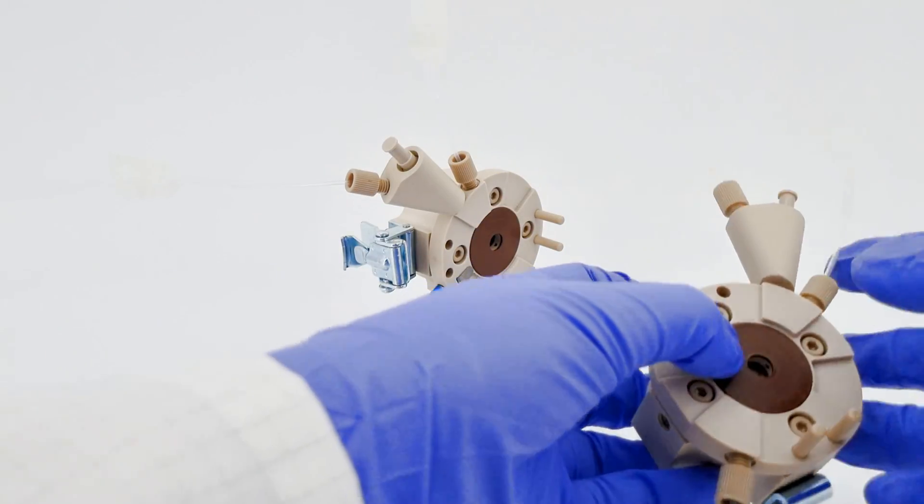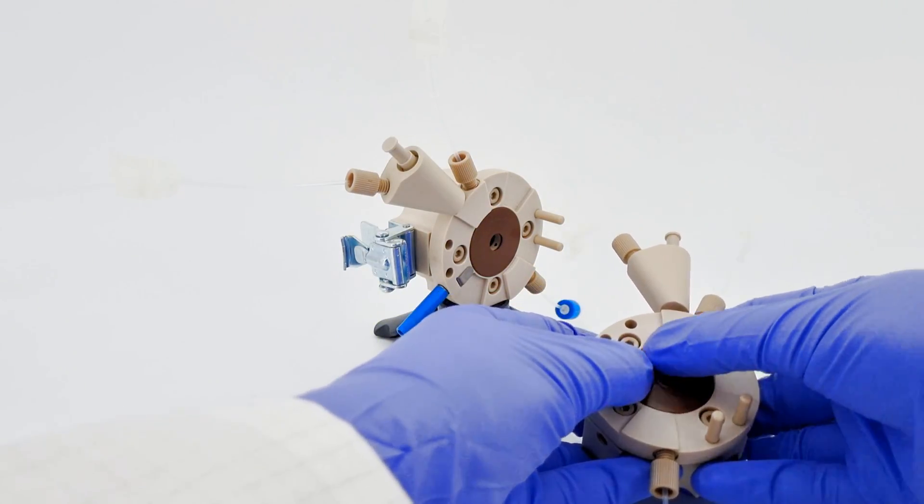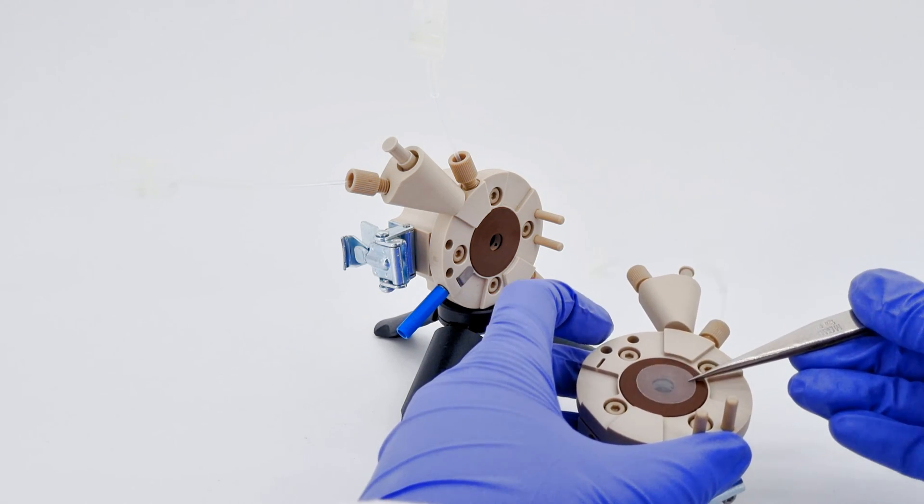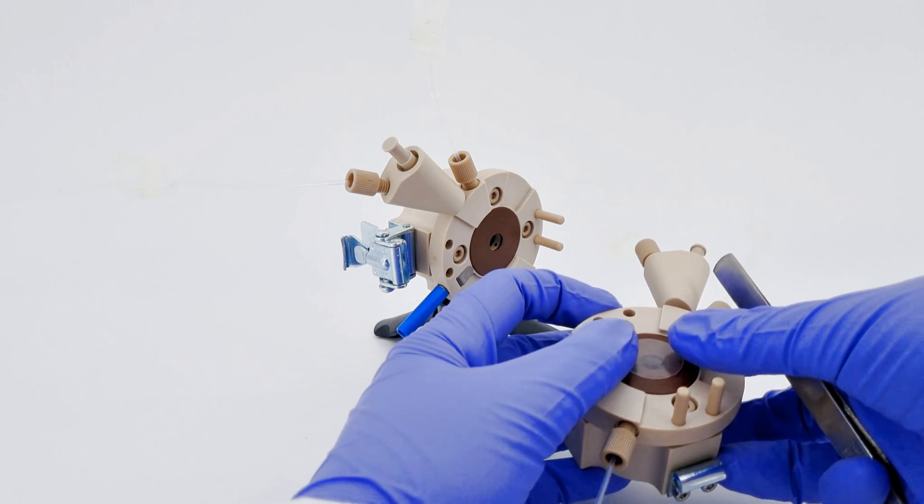Now, depending on the experiment you're running, you'll place either your metal alloy or a permeable membrane onto one of these gaskets. Gently apply pressure to make sure it adheres properly.